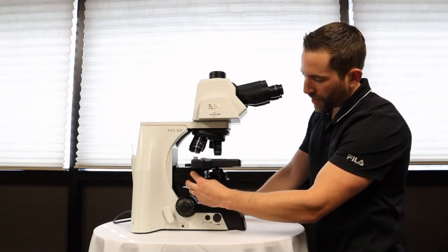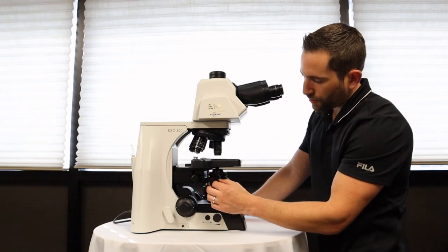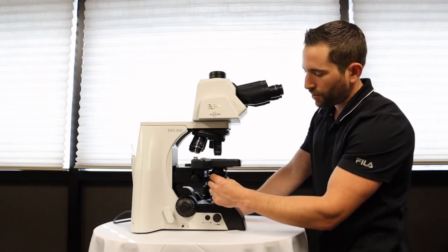You'll also need a flip-in flip-out condenser to use with the 2x objective lens, or a diffusion slider which can be inserted into the path of the condenser to cut on cost and accomplishes the same thing.